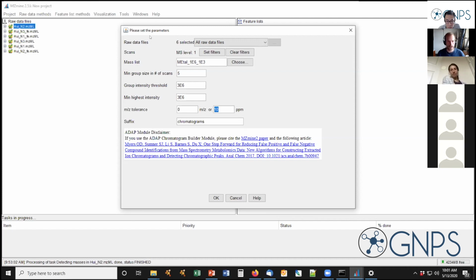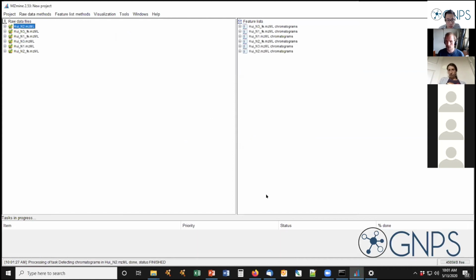So you need to build your extracted ion chromatograms on MS1. Okay, then we hit OK, and you should be seeing that something actually happened.